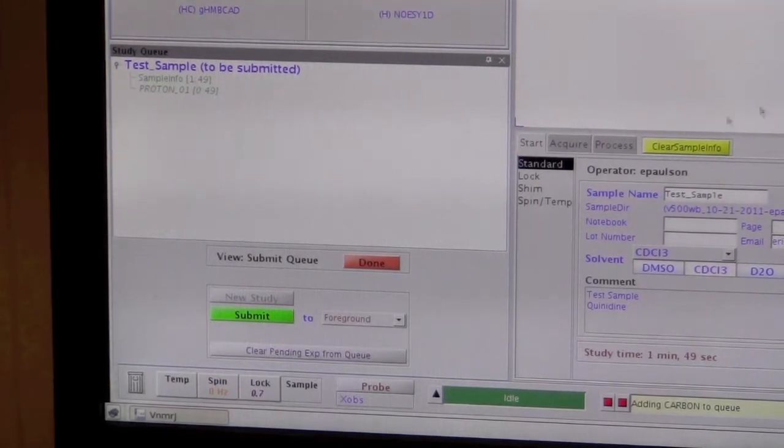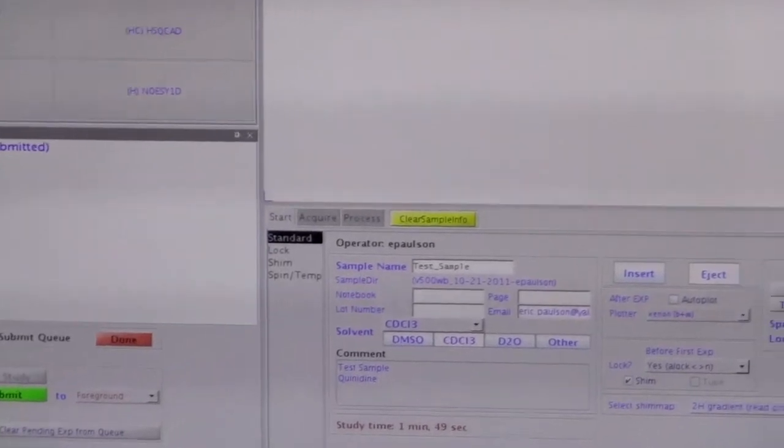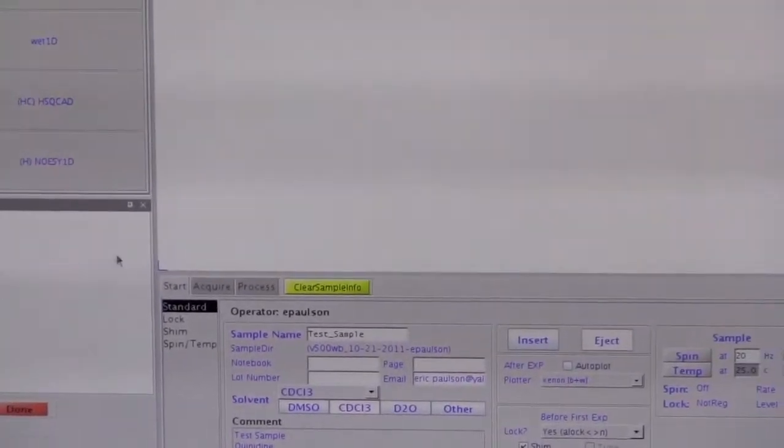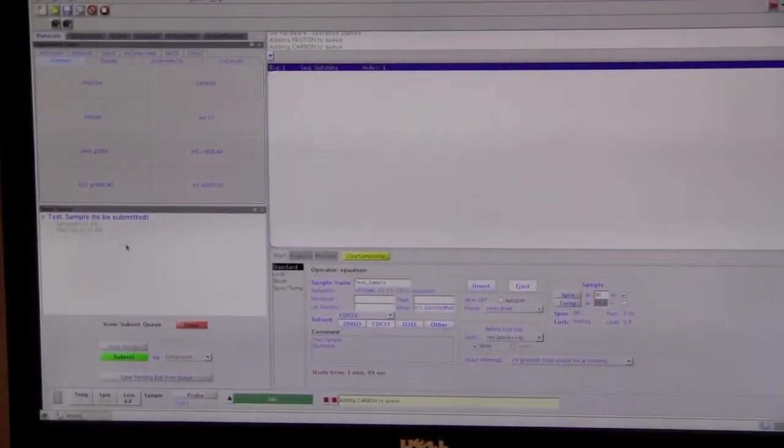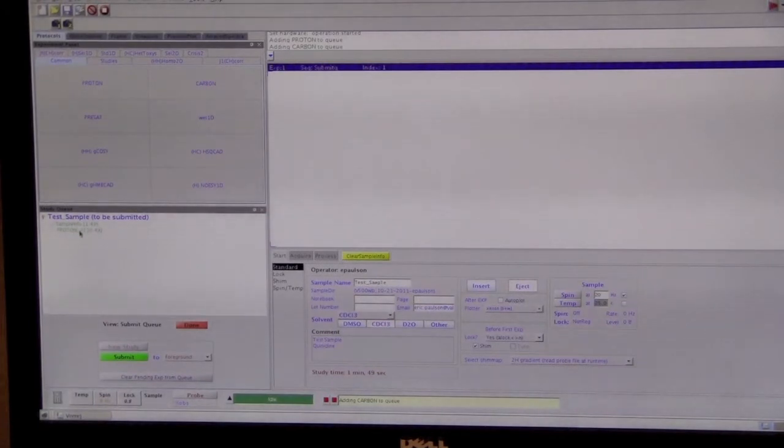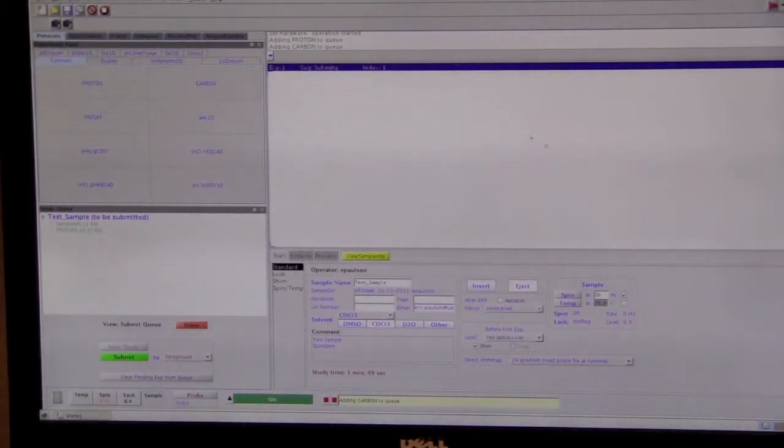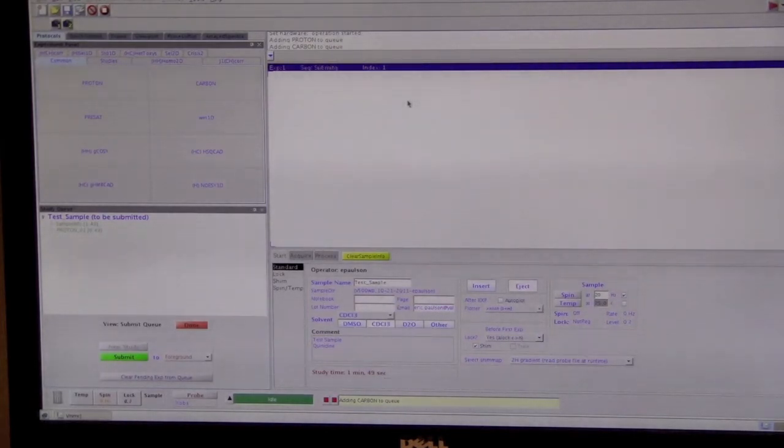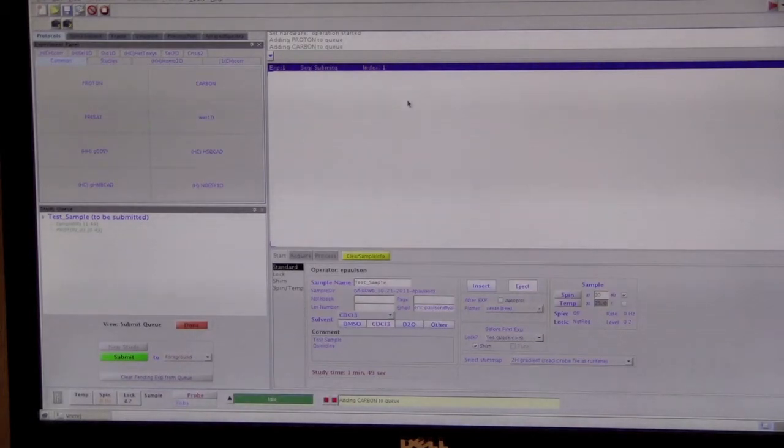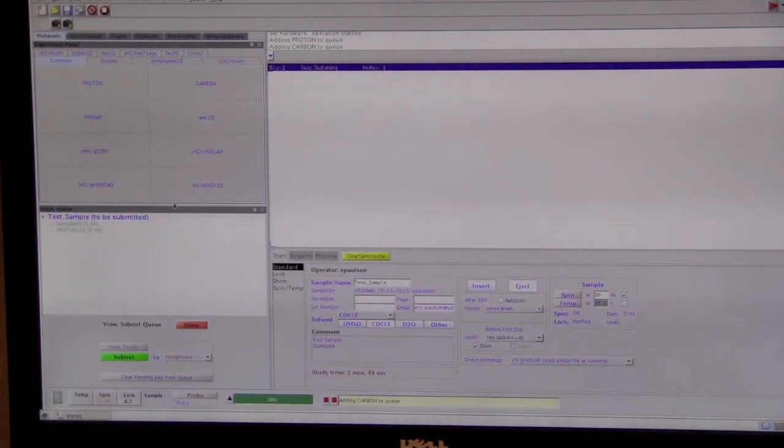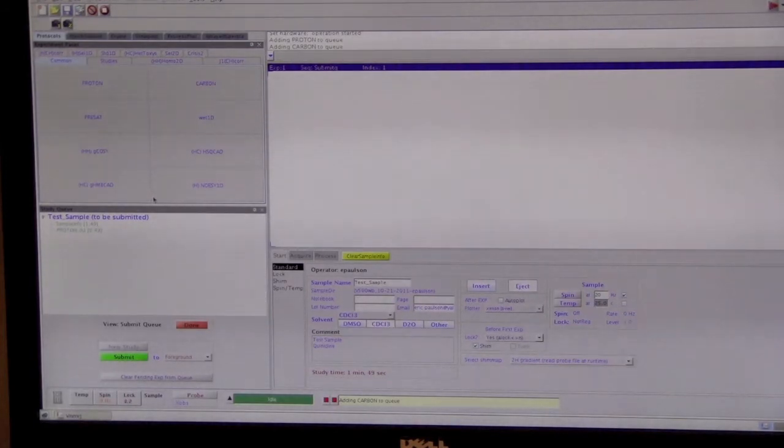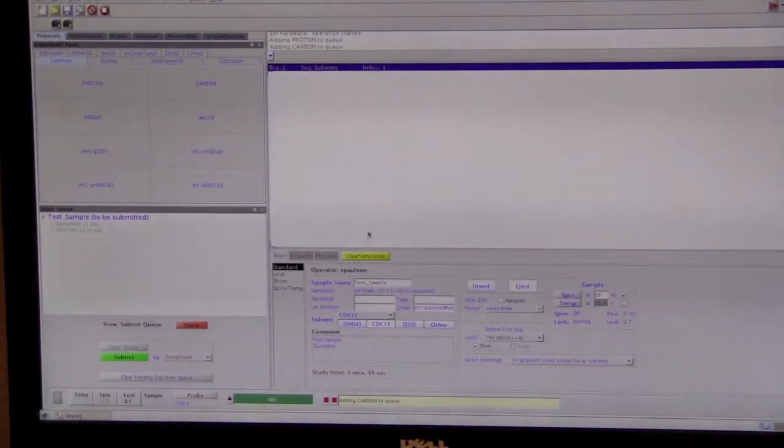After we click submit, it may not immediately tell you that anything's happening, but don't worry. It is doing something. Eventually, it should bring up a screen over here telling us what it's doing, but it may take a few seconds before it does it. One of the worst things to do is to start clicking on lots of different things while it is processing, and that can confuse it and cause the program to crash.